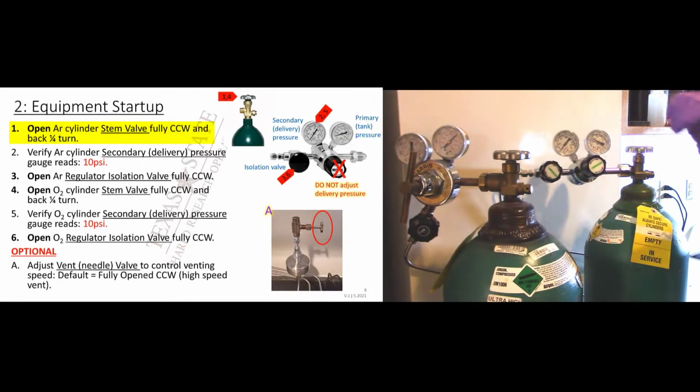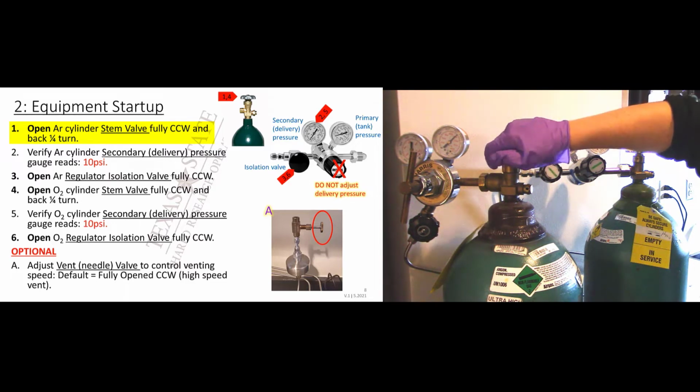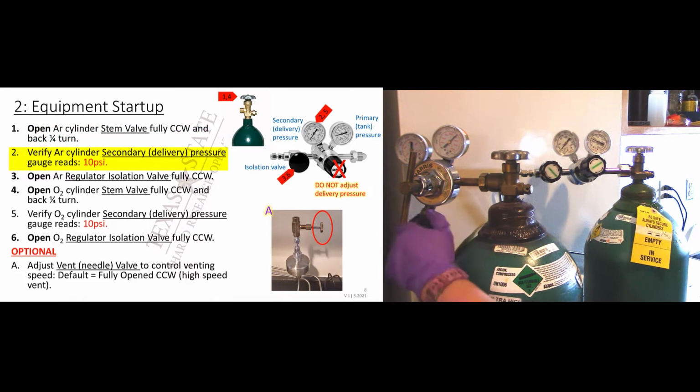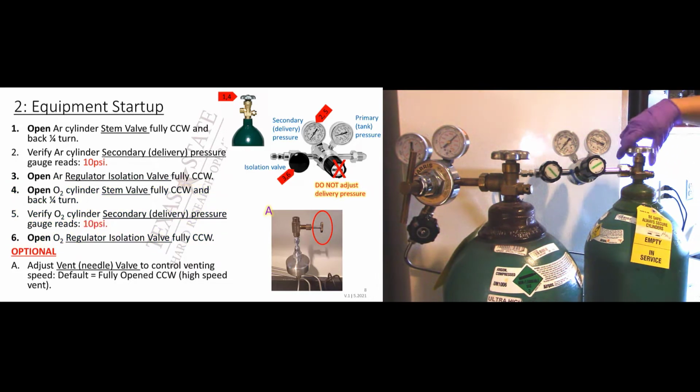Begin with your equipment startup. Open the argon cylinder stem valve fully counterclockwise and back 1/4 of a turn. Verify that the second delivery pressure gauge reads 10 psi. Open the argon regulator isolation valve fully counterclockwise. Repeat the same steps for the oxygen cylinder.